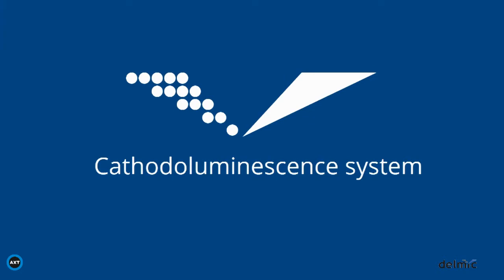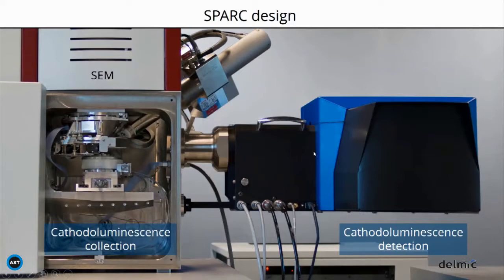So now we'll move on to the explanation of how you actually do a cathodoluminescence detection and what the system of Delmic actually does, the SPARC CL system. And this you see here. You see a picture of the system. And so here you see a scanning electron microscope. And so the CL system, the SPARC, is an add-on to SEM. And this SEM can be from different vendors. It doesn't really matter. It can be different models also. And our system is mounted on that.